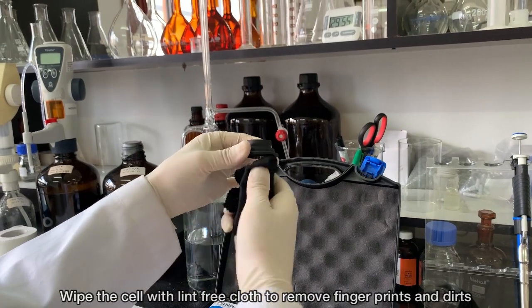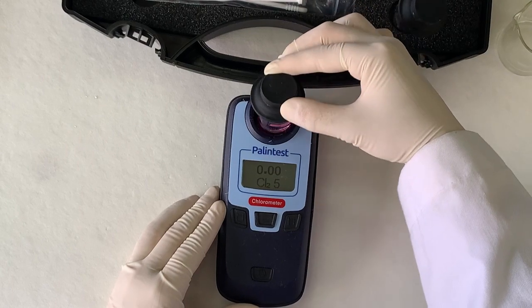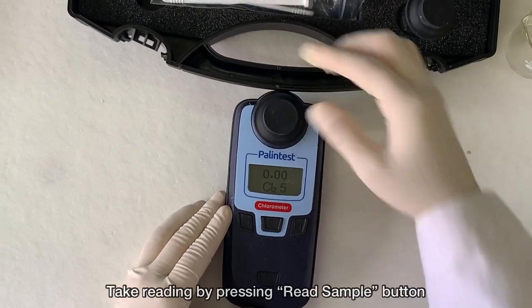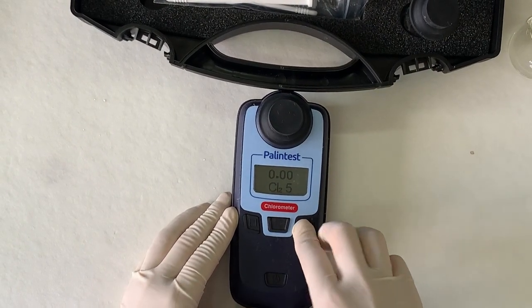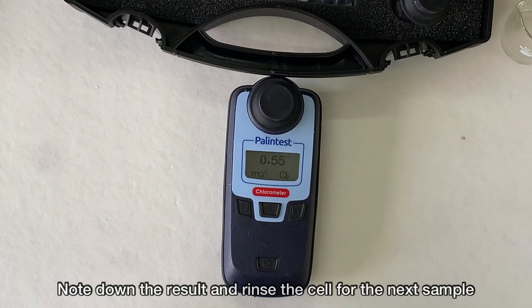Wipe the cell with a lint-free cloth to remove fingerprints and dirt, which will interfere with the result. Take the reading by pressing the read sample button. Note down the result and rinse the cell for the next sample.